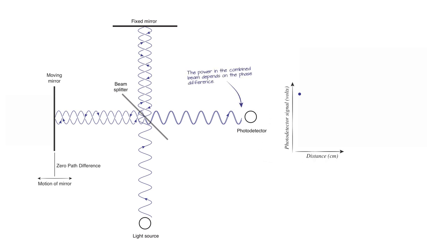All right. So the power depends on the phase of the light when it hits that photodetector. If the two segments of light that were separated and recombined are in exactly the same phase, basically meaning they're exactly in their original state, we'll have maximum power. If they're not lining up perfectly, we'll have not a complete addition of their power, and therefore we'll have less power. So let's see what happens here. Let's move the mirror a little bit. Look what happened. I moved the mirror. Look at the difference here. I moved it that little bit.